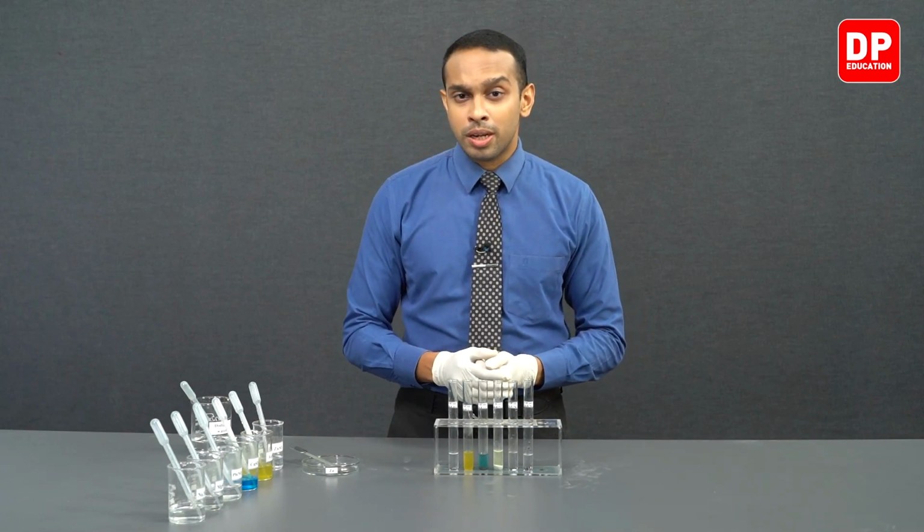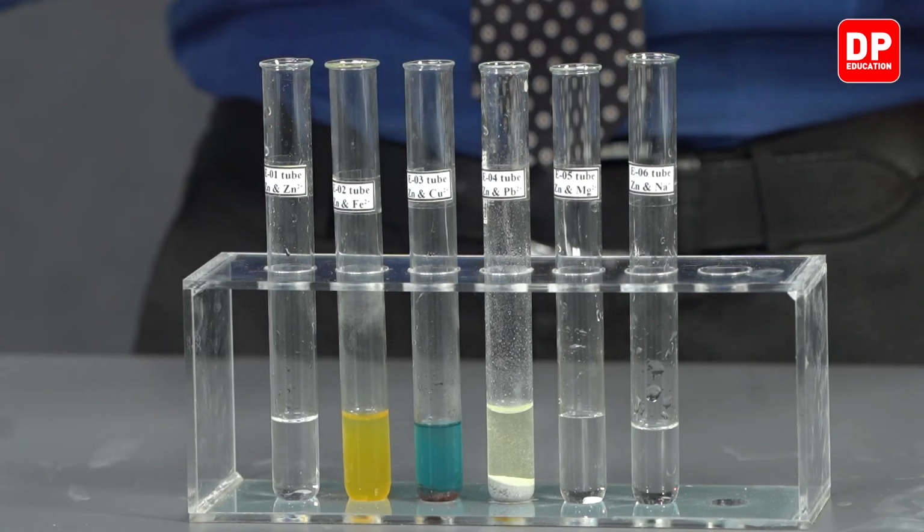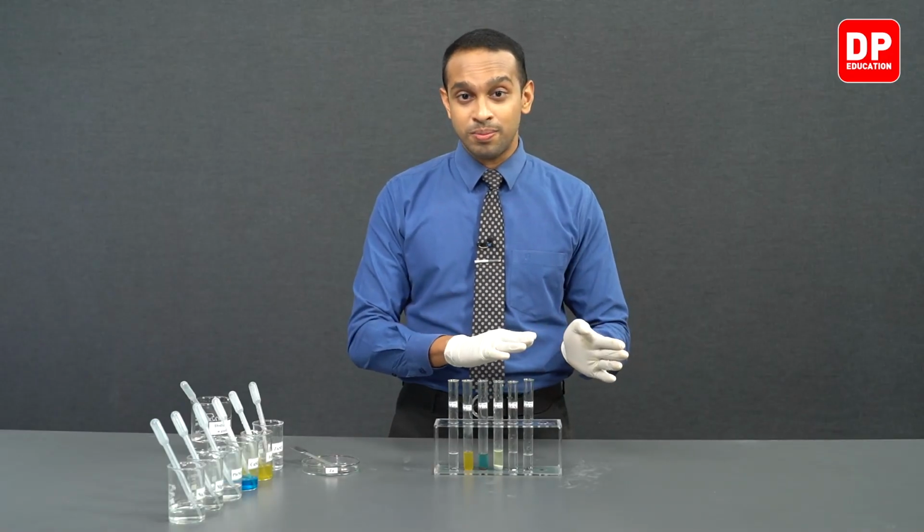Then out of all of the metals that we tested over here, magnesium was able to displace all of the metal ions as metal solids. However, magnesium was not able to displace sodium 1 plus aqueous ions as sodium solid. So this would indicate out of the metals that we added to these aqueous solutions, magnesium was the most reactive, but we had another solution over here, sodium 1 plus. Sodium 1 plus did not get displaced, meaning sodium was more reactive than magnesium.